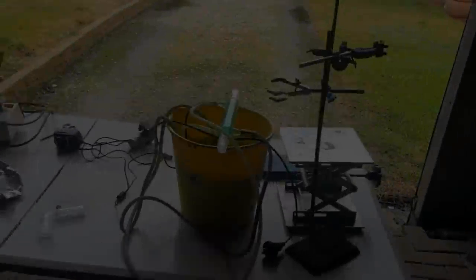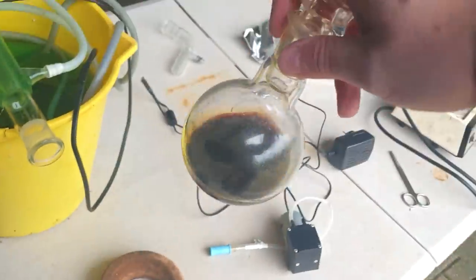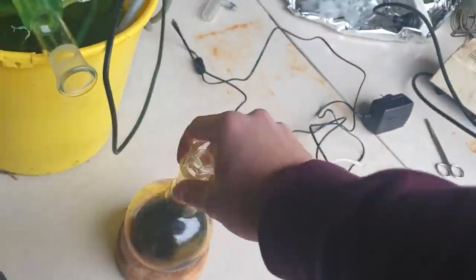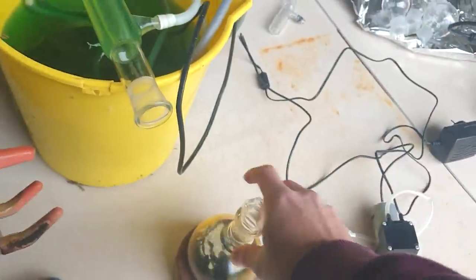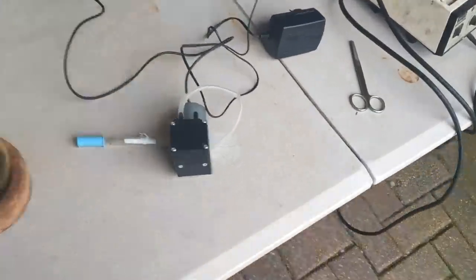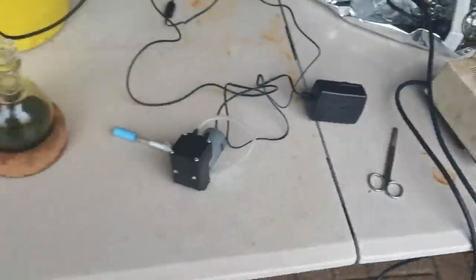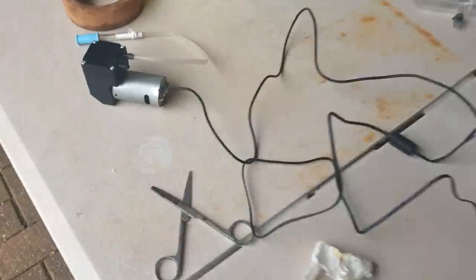All right, here we are. We're nearly ready for our vacuum distillation. This is our solution. If you've forgotten what it looks like, it looks pretty bad. But we'll run that through the distillation now. We know there's a little bit of toluene left over, so we need to take some fractions, which is going to be annoying. What's also annoying is that I broke the connection on the vacuum pump, so I've got to resolder that. And a few other things, but all right, I've repaired that badly, but at least it's repaired.